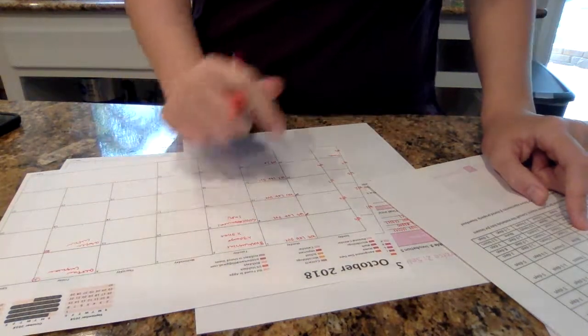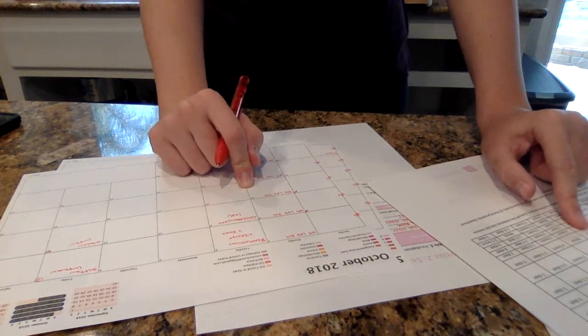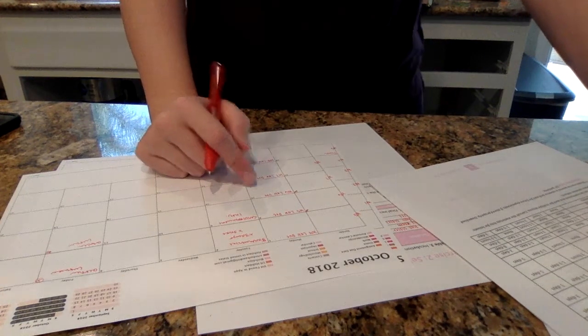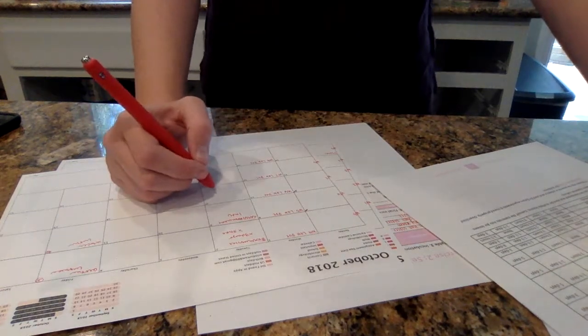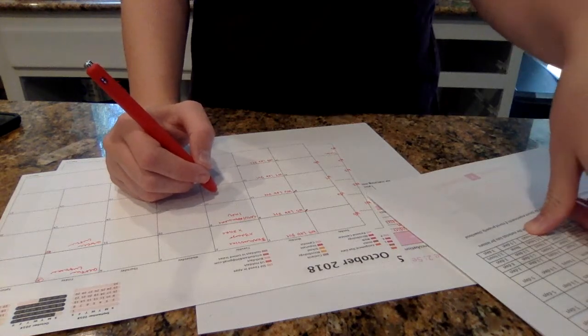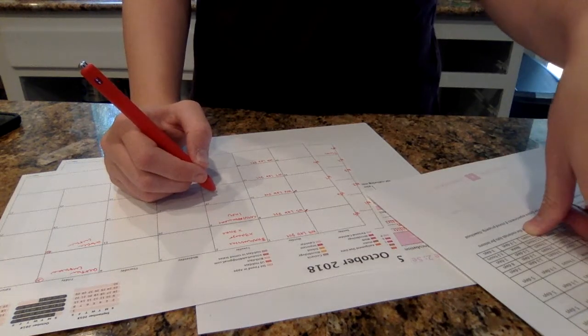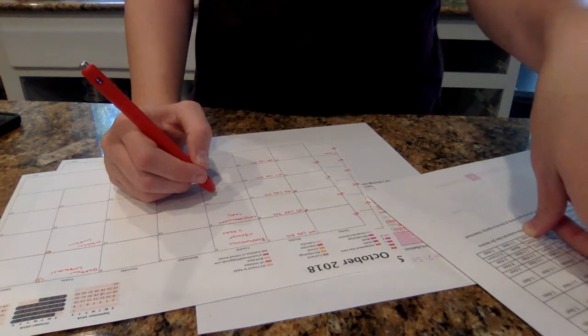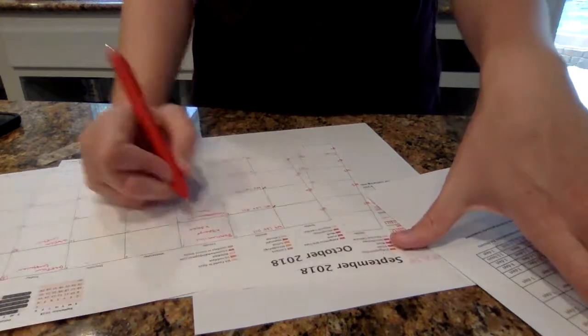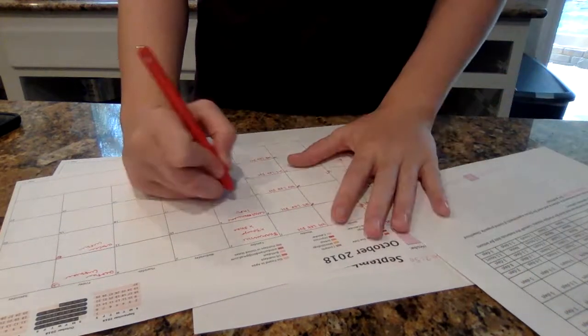And I will be finishing the Sunday before the actual due date. Week 7, I have antibiotic sensitivity. 1 to 3 days for an active culture. There's 1 hour plate pouring, active time of 3 hours, 1 to 3 days in incubation, and then average time is 5 days. So it's similar to week 6, but there is a 1 hour plate pouring.